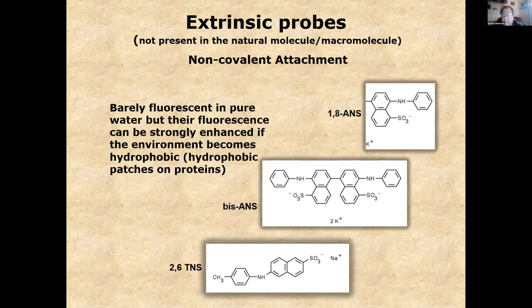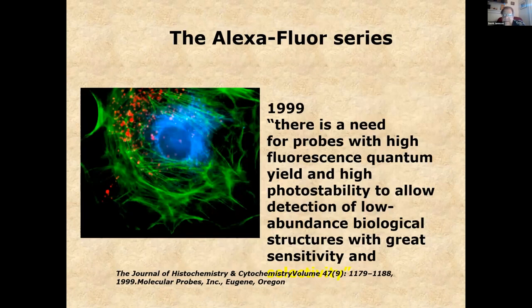Here are some non-covalent ones, like the famous ANS molecules, and we'll learn more about those later, that are weakly fluorescent in water, but very strongly fluorescent in a hydrophobic environment, like hydrophobic patches on proteins or with membranes.